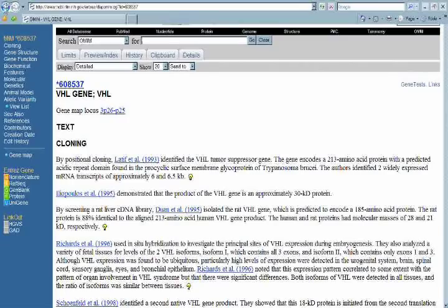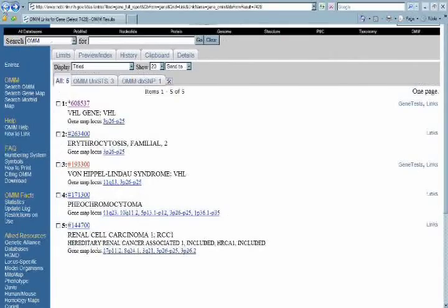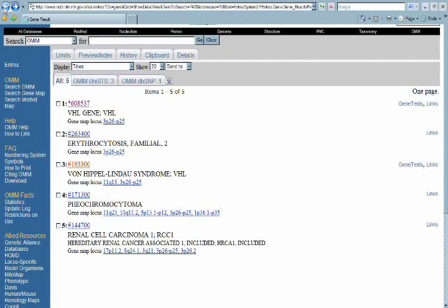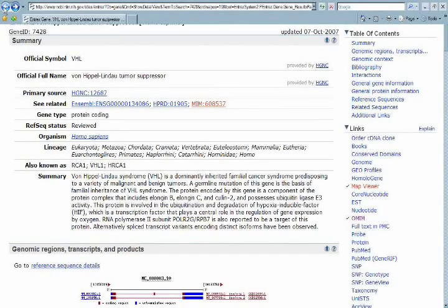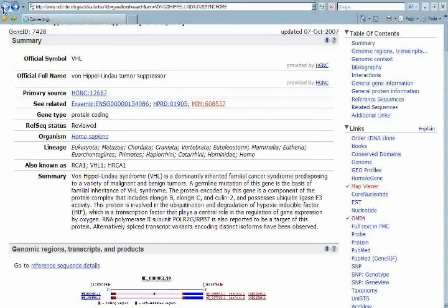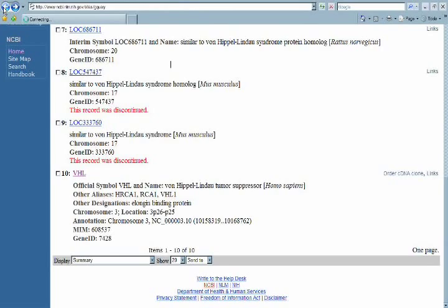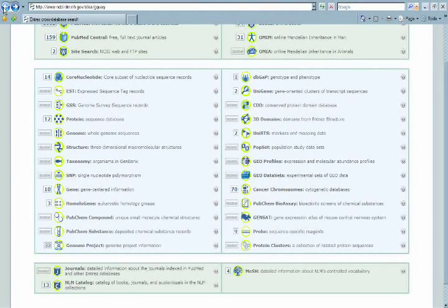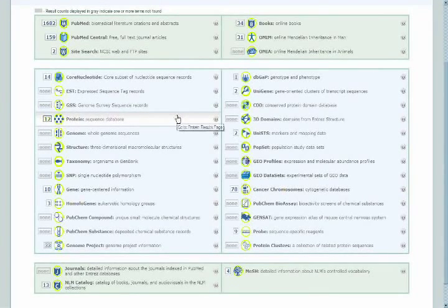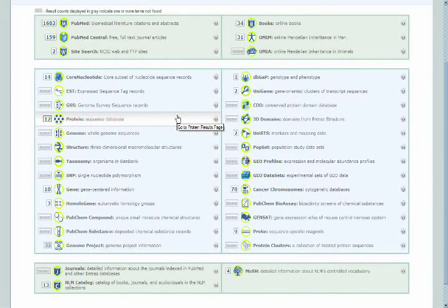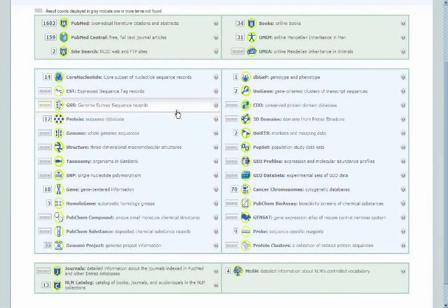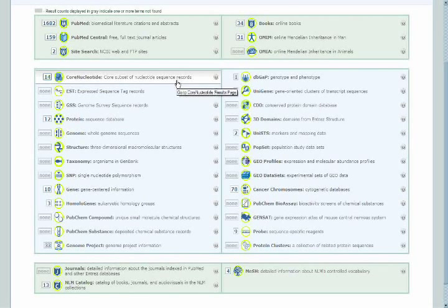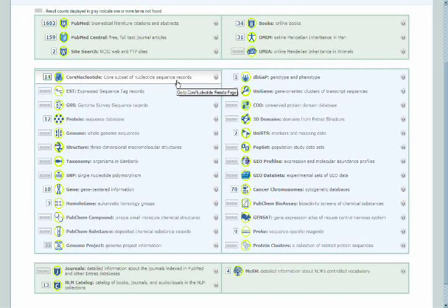Now if we go all the way back to the ENTREZ Summary page and then further back to the actual ENTREZ page itself, where we had our original search results, we'll see there are all sorts of data points, everything from protein sequence information to the core nucleotide sequences. These would be the GenBank entries associated with this particular gene.